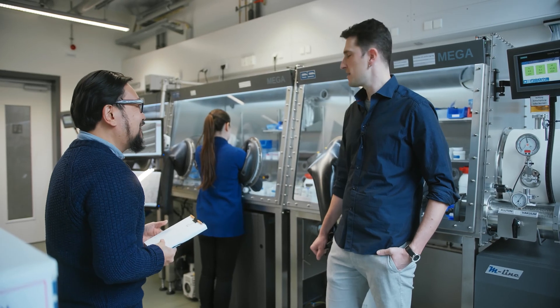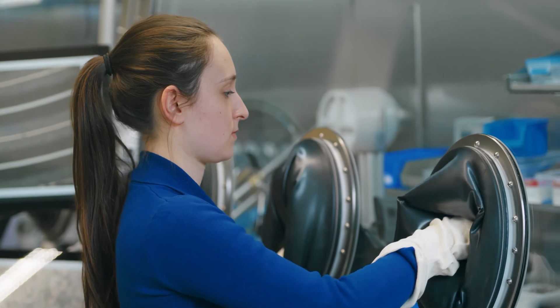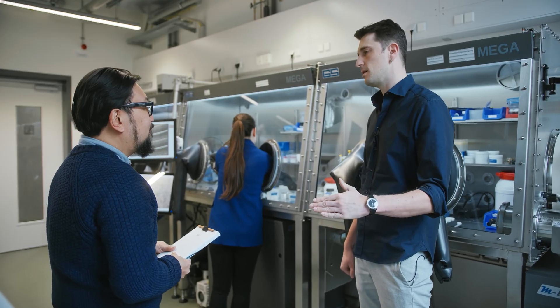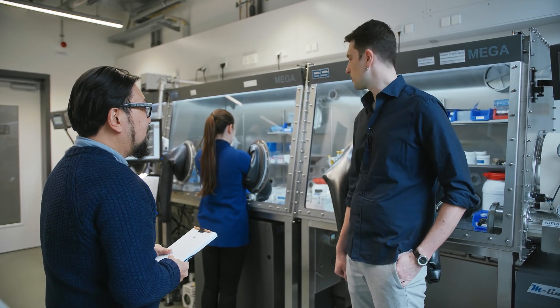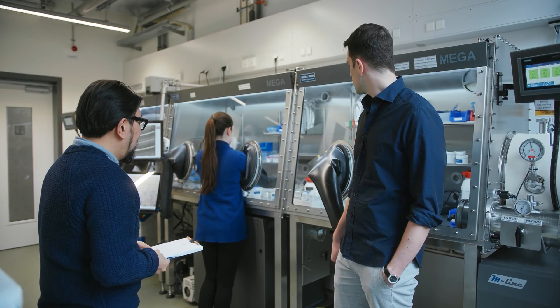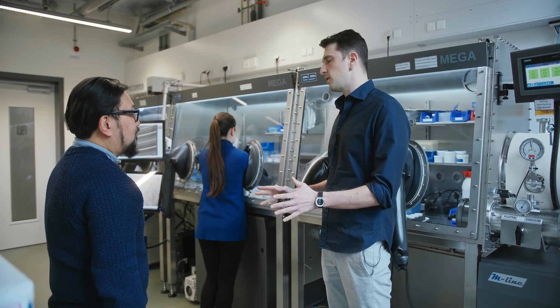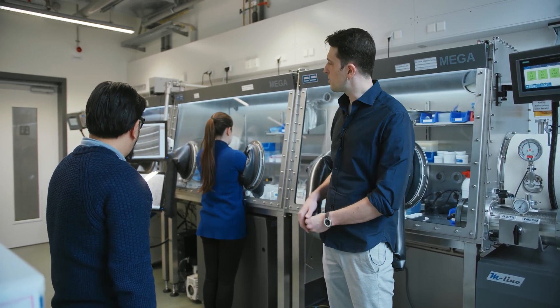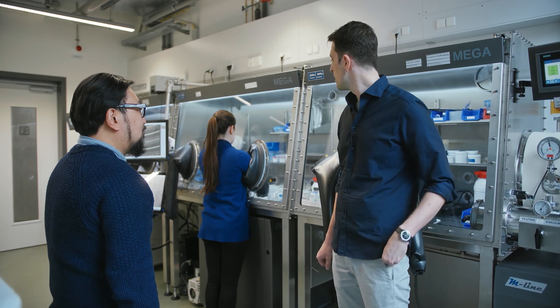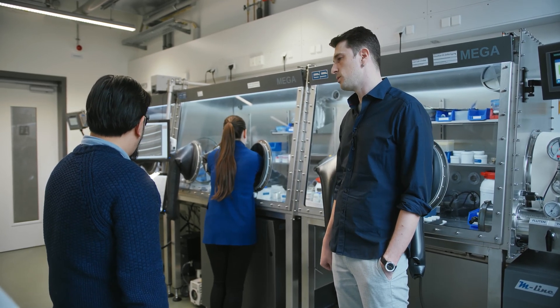So what are we doing here? We open the battery cells and get out the electrolyte. We also do a washing to get out the electrolyte inside the pores, and after that we can proceed with the further preparation of the cell. There's a lot of different equipment. What equipment do you typically need to do this type of work? It depends on the investigation we want to do. There's also a microscope inside the glove box to avoid any interference from side reactions, or we do some cell testing in here to test the electrodes.